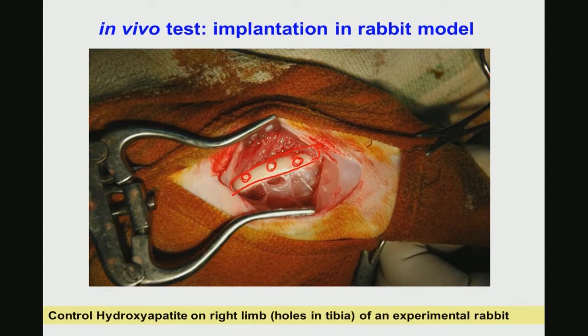The holes were drilled with a precision drill, with a diameter of 2 mm as per the ISO standard. The cylindrical rod that goes inside, made of the glass ceramic material, is typically 5 to 6 mm in length.